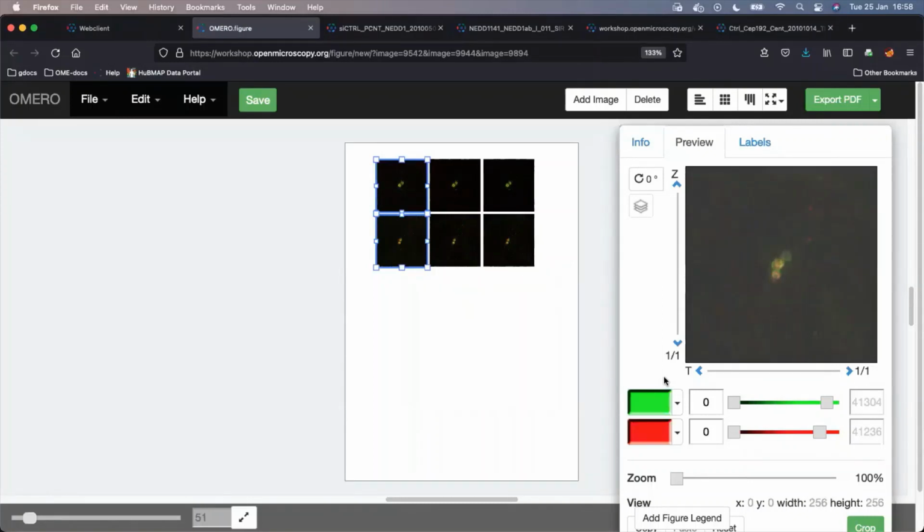But the thing is that it's communicating between different software, and when you make a mistake, you would have to go the whole circle back.